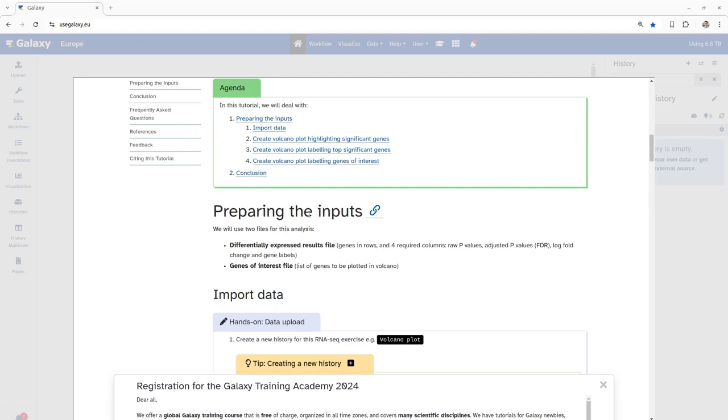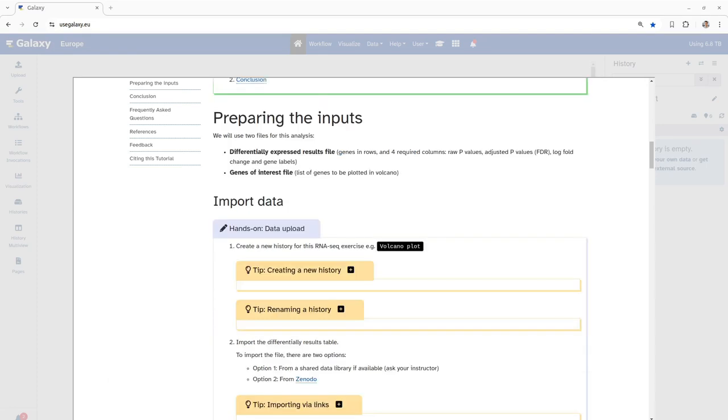First coming to the inputs. As mentioned earlier, we would require two files for this analysis. First, differentially expressed result file. Ideally this file consists of genes in each row and four required columns consisting of raw p-values, adjusted p-values, log fold change and gene labels. Second file which would be requiring is the file consisting of genes of interest. Once we have these two files, we will now proceed further with importing this file into Galaxy to perform our visualization of RNA-seq data.